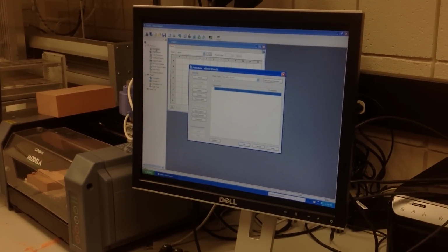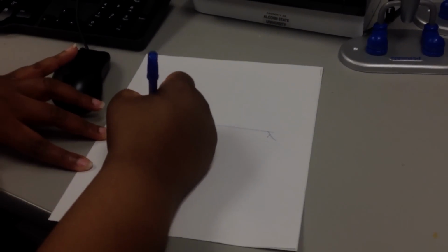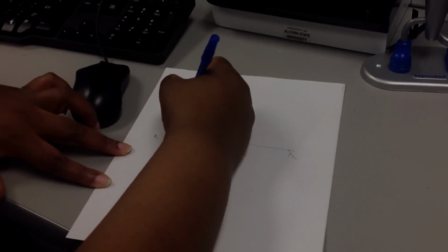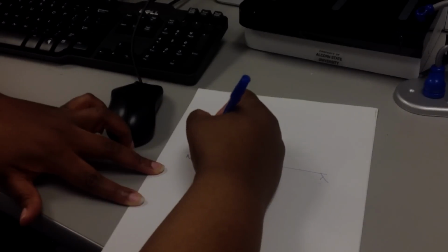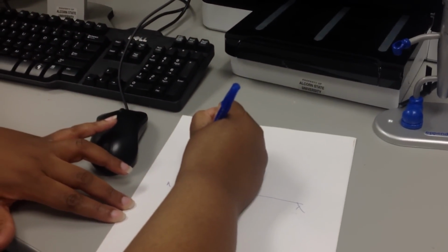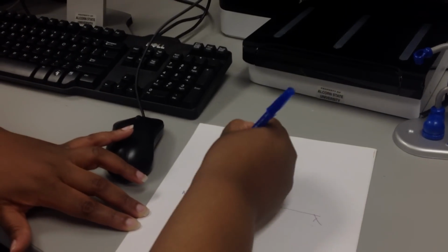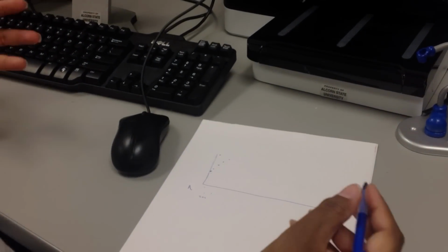Awesome. So what this is doing, this is a wavelength, the wavelength of light on the x-axis. So it's going to shoot a wavelength of light at every wavelength. So if you wanted to do every 2 nanometers, it's going to shoot the light through, and it's going to get a point on the spectrum that tells you how much light is absorbed. If it's a lot of light at that wavelength, you're going to get a higher value here. So you can do it at every wavelength, or you can do it at every 2 or every 4 or every 10 or whatever.